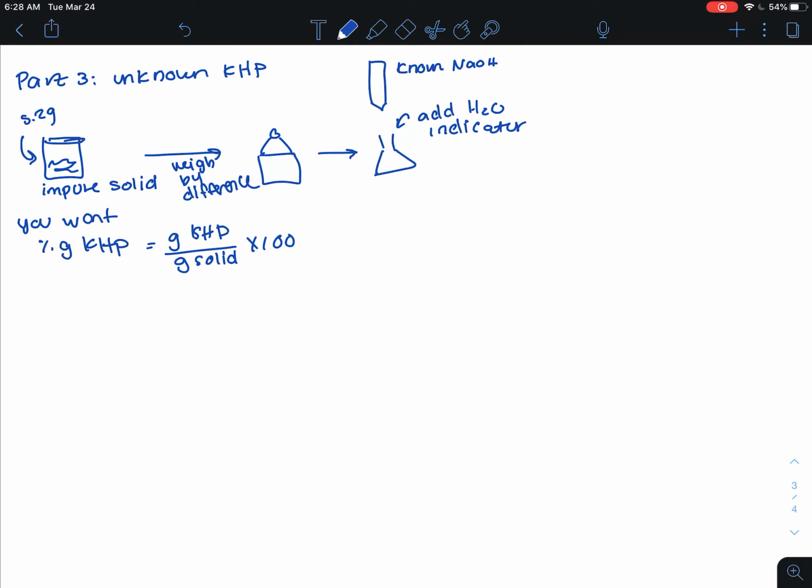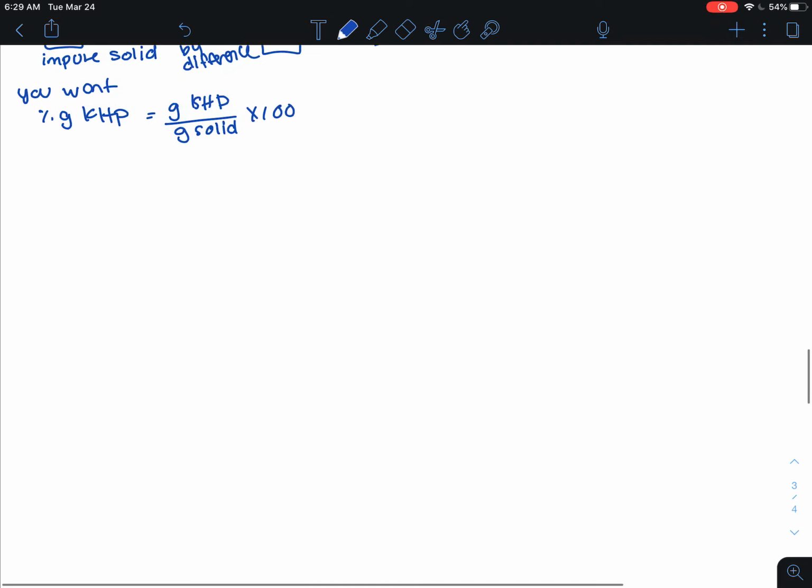There you go. So now that was the pre-lab and post-lab discussion, actually. We'll just keep it in one video. I know I said there'll be two, but I kind of did both in one. If you take a look at your data sheet, you'll see that you have 3 trials, and this will be for the 3rd day. So this is pretending like we've already done the first 2, which was kind of prepping for the 3rd day. And you have 3 trials.